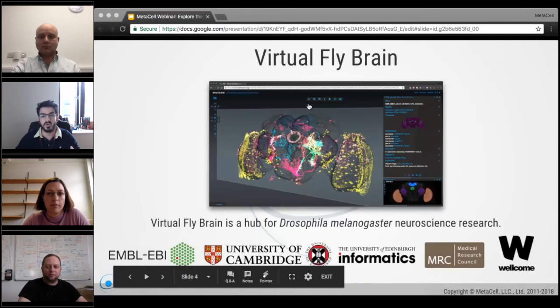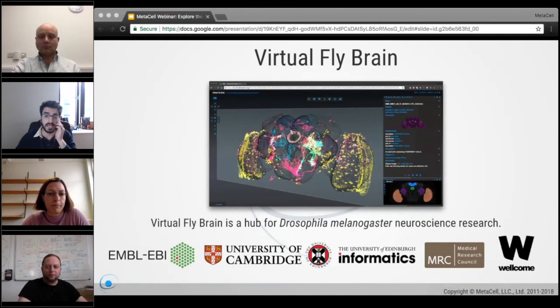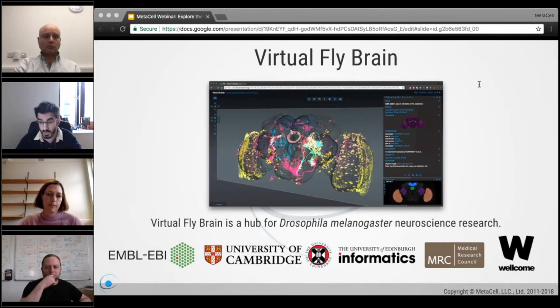Let me move forward introducing Virtual Fly Brain and how it can be used to explore the brain of a fly. VFB does extensive curation of literature in collaboration with Flybase and allows users to explore diverse types of annotated imaging data, from confocal slices to neuronal reconstructions. VFB is a joint effort of different universities and research groups. We have the European Bioinformatics Institute, the University of Cambridge, University of Edinburgh, the Medical Research Council at Cambridge, and it is funded by the Wellcome Trust until 2021.